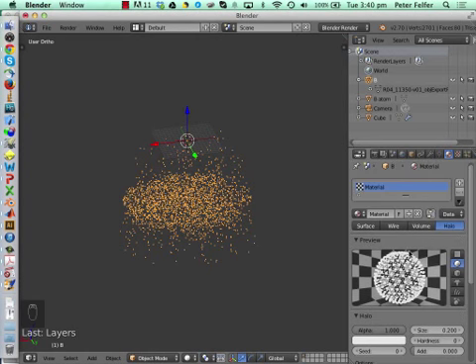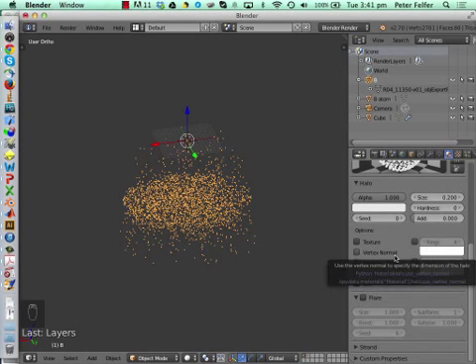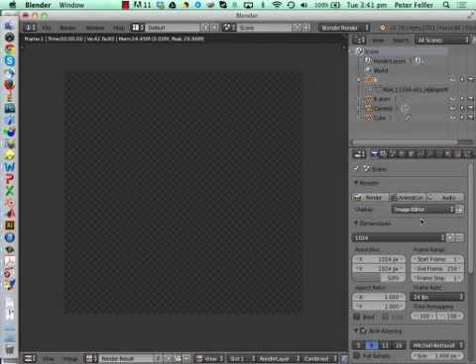But also, whenever you're working with Blender, work with modifiers and things as much as possible so that everything you do is as reversible as possible at any time. So, why are we not getting anything with the halo material? That's a bit odd. Because it's not shaded.